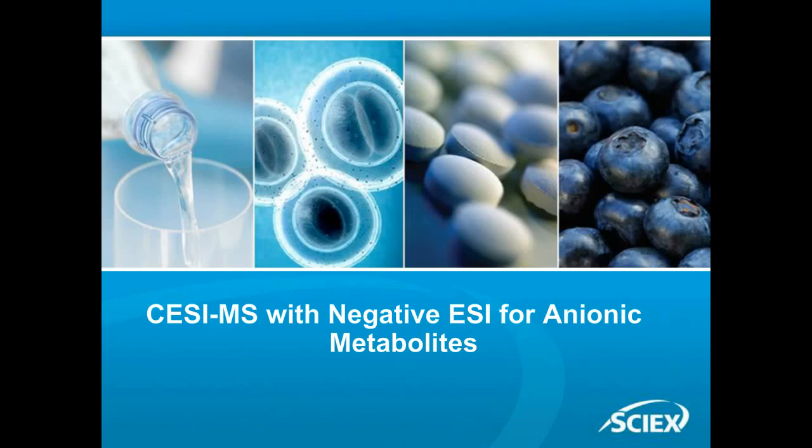But I suppose the major challenge for me was actually flipping this now to connect CE-MS to negative electrospray, because if you look at the literature, there are some questions around the possibilities of doing this. What I tried to do initially was to use the same methodology as I used for the cationic screen, the same capillary, the same background electrolyte solution, to start to run in negative electrospray. Of course, now you're looking at negatively charged ions, so the thing you have to do in the method is change the polarity of the separation voltage to drive your target compounds to the mass spectrometer.